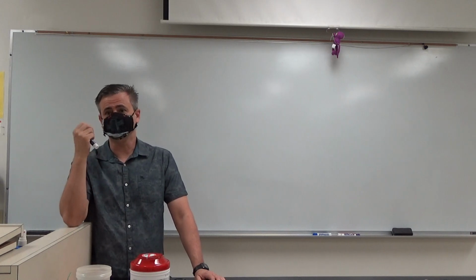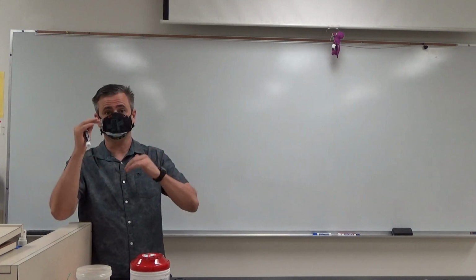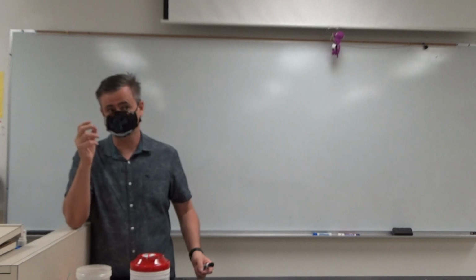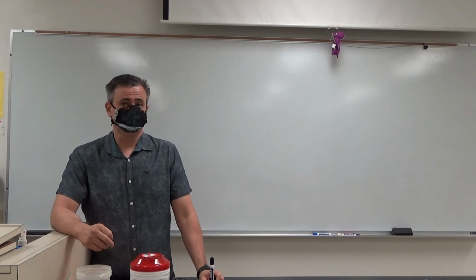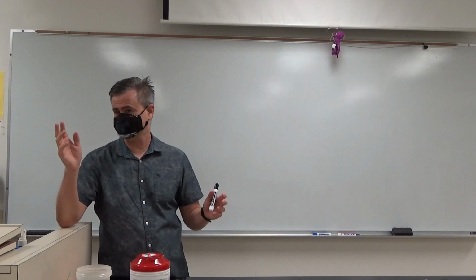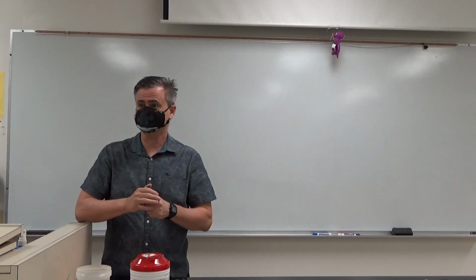So we'll be able to identify a lot of the things we made, and then we can also get an indication of what's the ratio, is this the major product, and very specifically, okay? And then we'll be able to take those ratios. You'll be able to take your mass. You came up with a mass at the end. Oh, okay, I made 130 milligrams of product material, okay? And you'll be able to take those ratios and go, okay, well, 10% of that was 1-methylcyclohexene, okay? And so you'll be able to get a percent yield for 1-methylcyclohexene based on the 10% of 130 milligrams. Does that make sense?